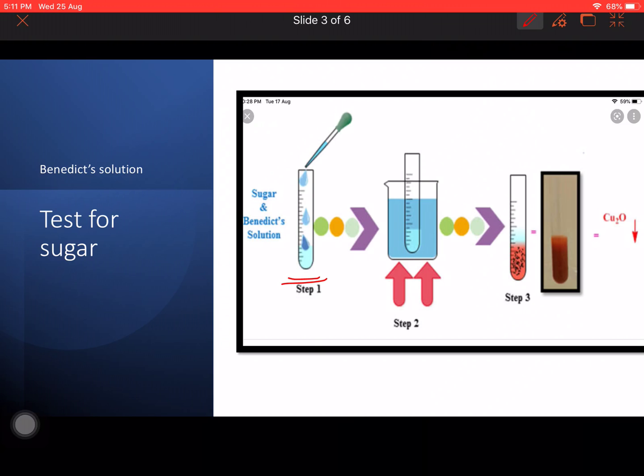When we are doing certain tests in the lab, if we are given labeled test tubes like 1, 2, 3 and 4, and I choose the third one, we don't know whether it is a starch, a fat or a protein. So we need to perform each and every test to identify what it is. But now we are learning each step of the different tests separately.